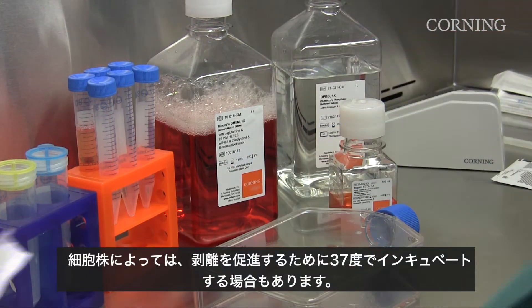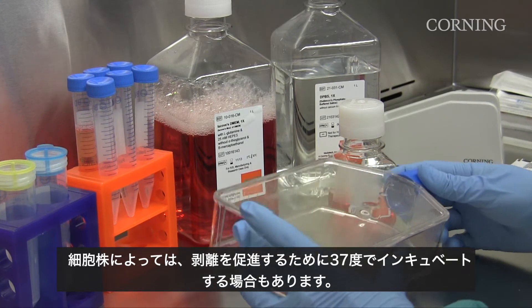Depending on your cell line, you may want to incubate the vessel at 37 degrees to promote dissociation.